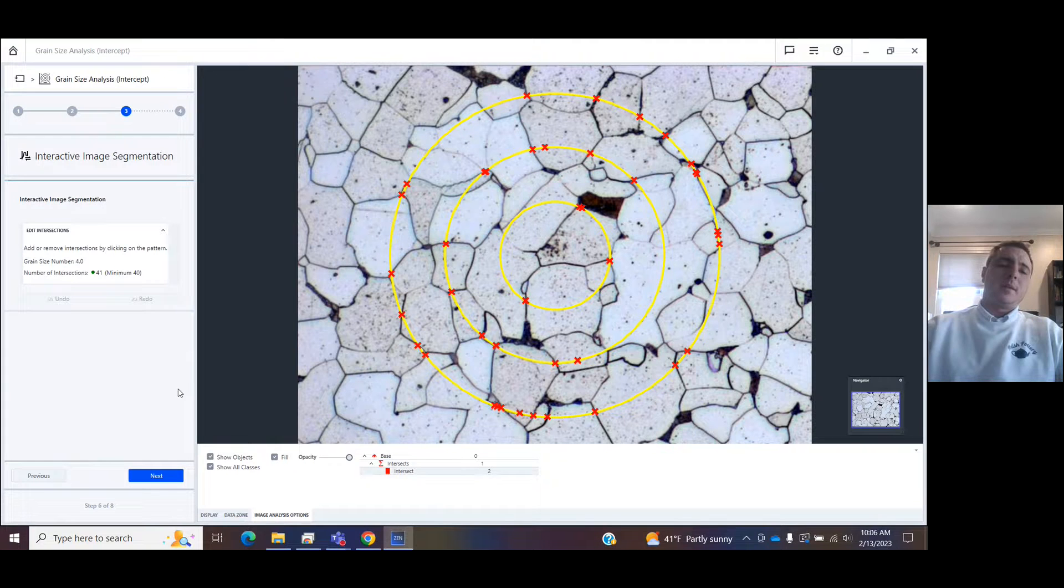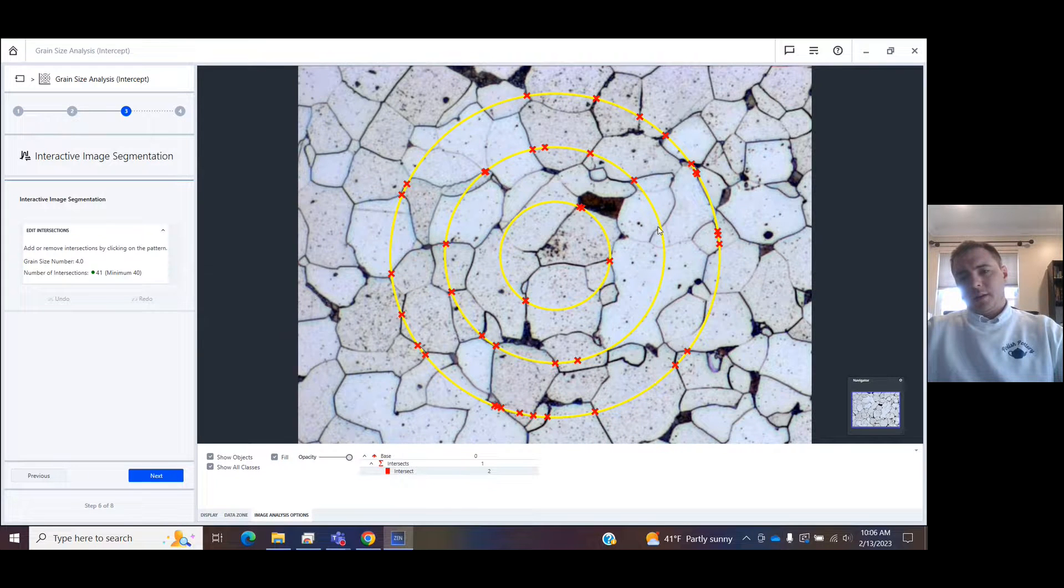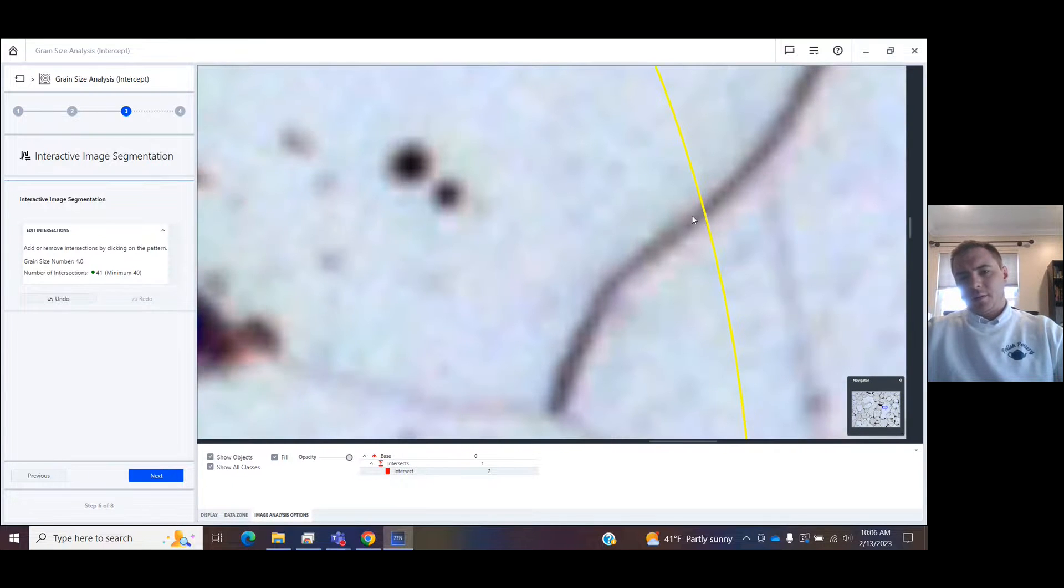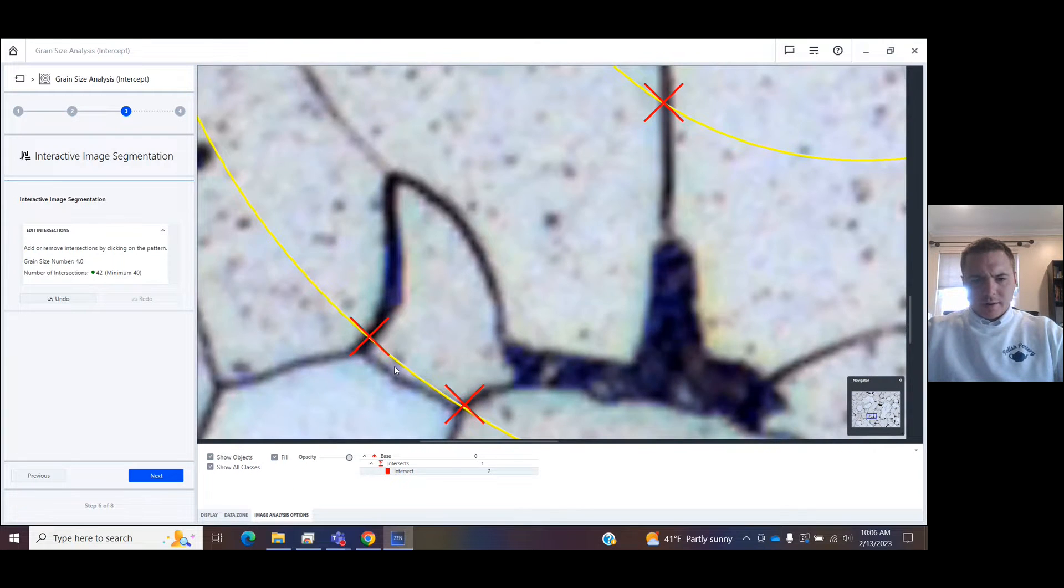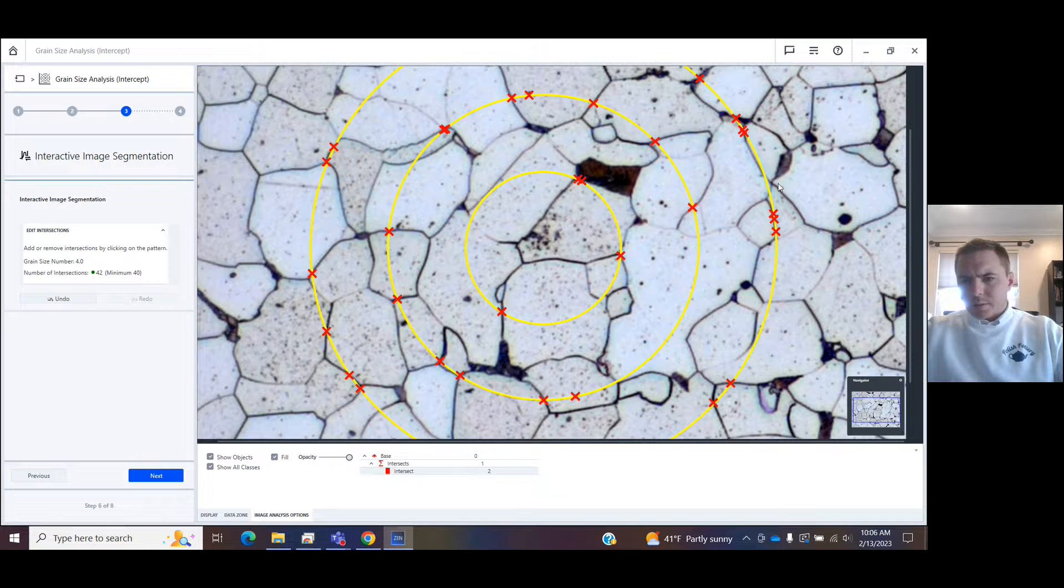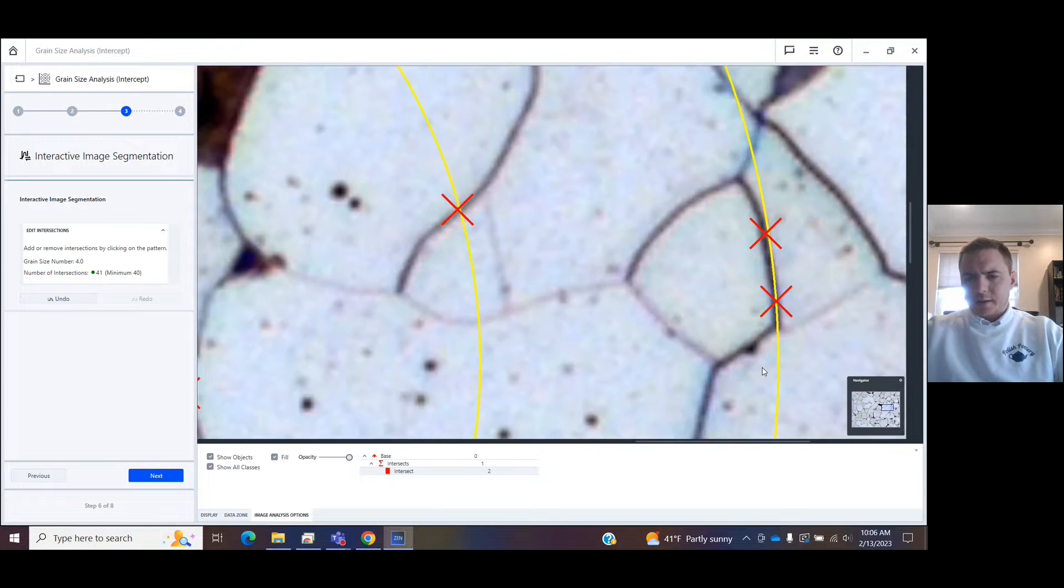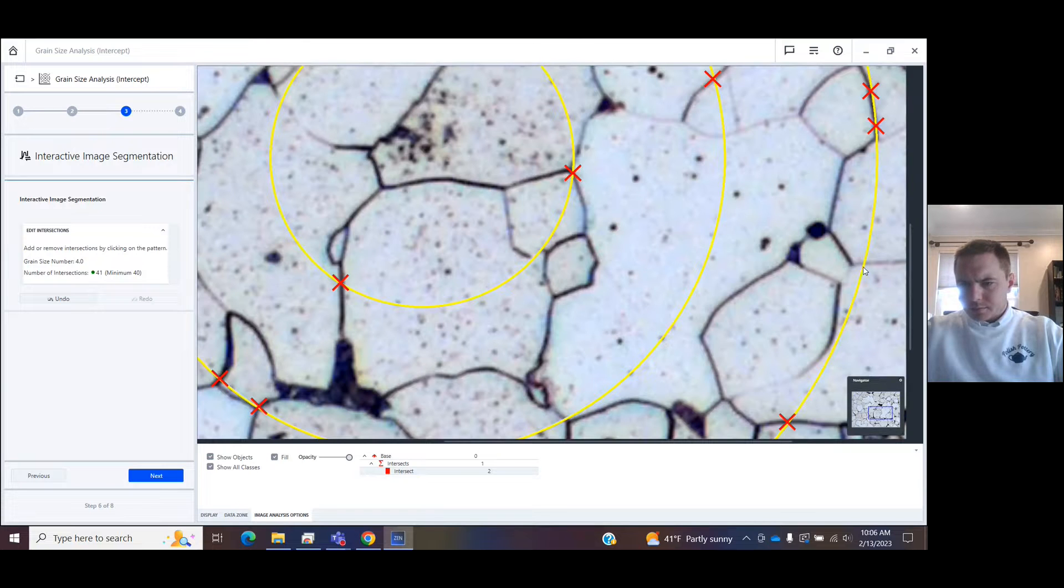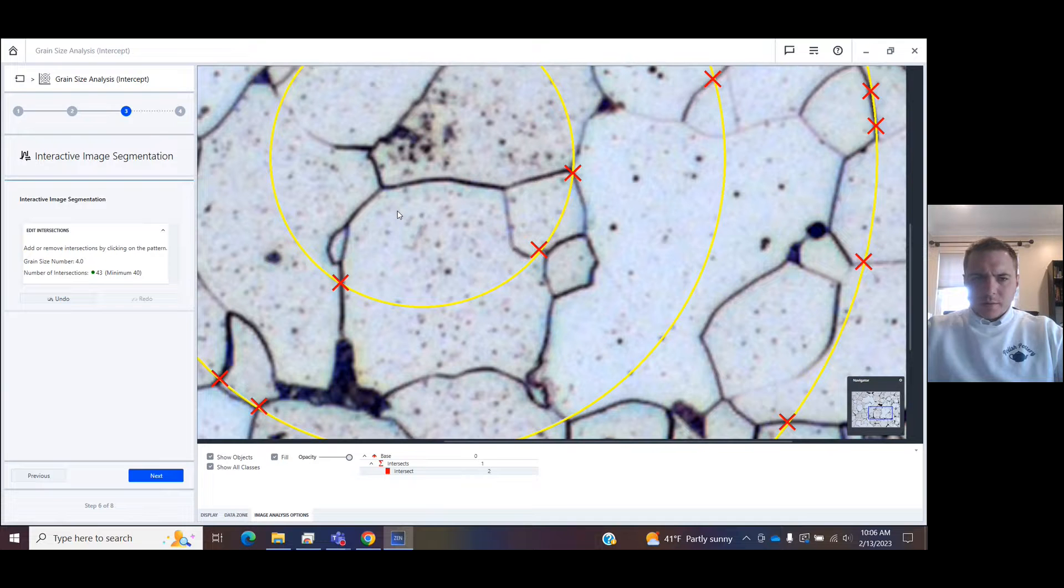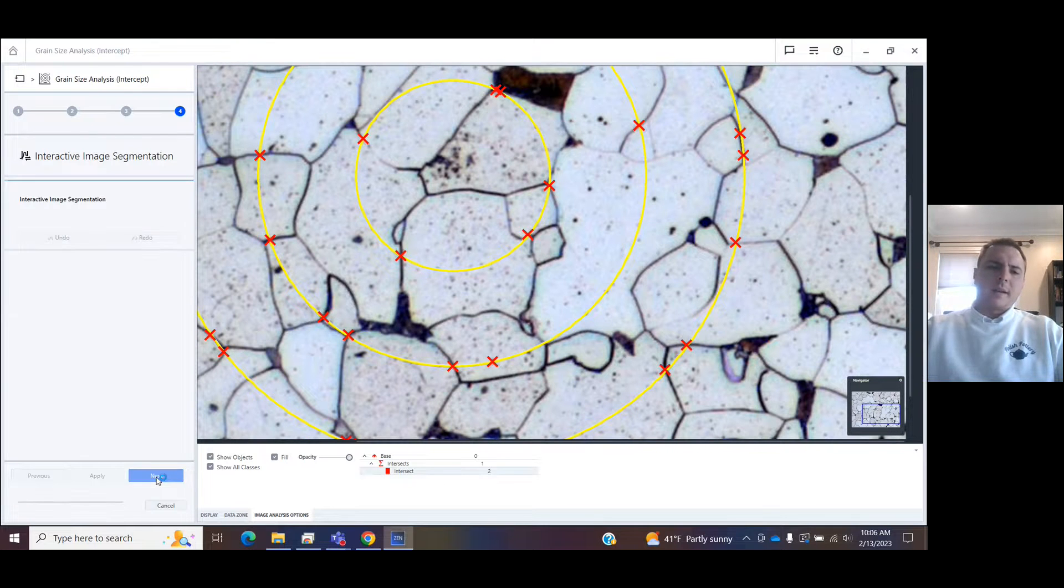In the next step, you can manually override what the software has found by adding and removing. For instance, I see this right here. I'm going to add it. I come down here. Looks good. Looks pretty good. If I wanted to remove one, like one of these, you can just click on it and remove. I'll add one right there too. Right there. Then click next.